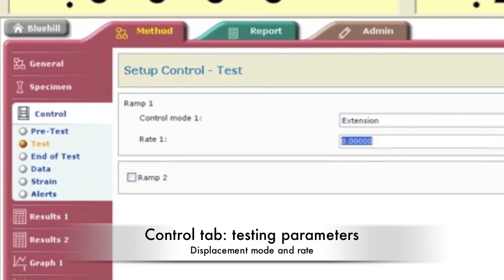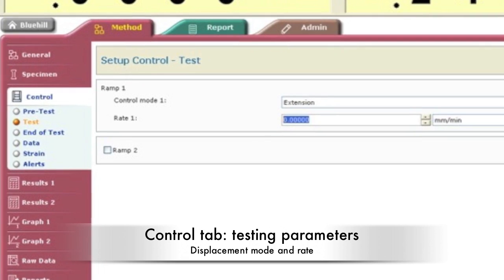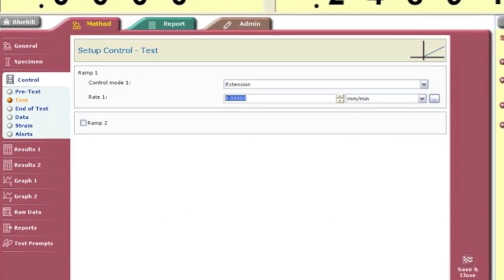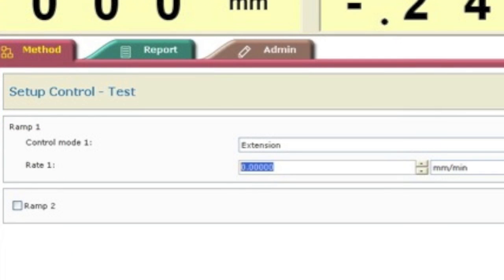The control tab describes the test. Select extension for mode of displacement, then specify the rate of extension. Most use 5 mm per minute or 50 mm per minute, depending on if you want a slow or fast test.